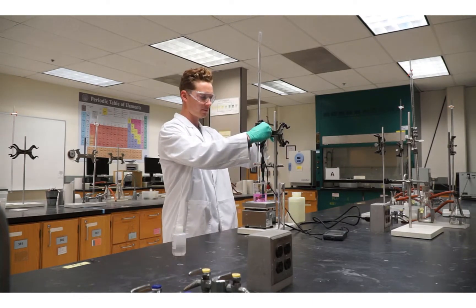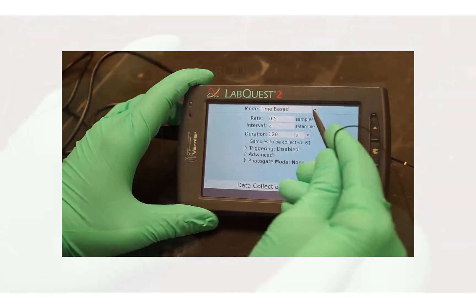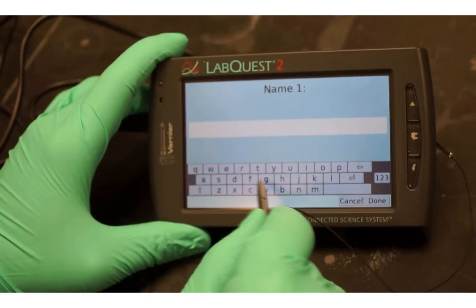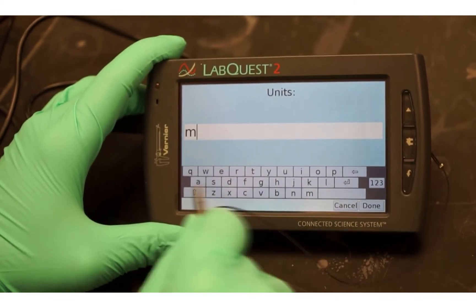Remember, we do not want the glass bulb to break. On the LabQuest, tap Mode. Change the Mode to Events with Entry. Change the Name to Volume. Change the Units to Milliliters, and tap OK.